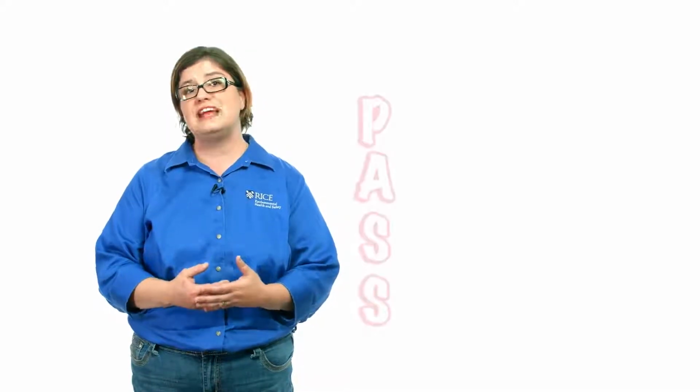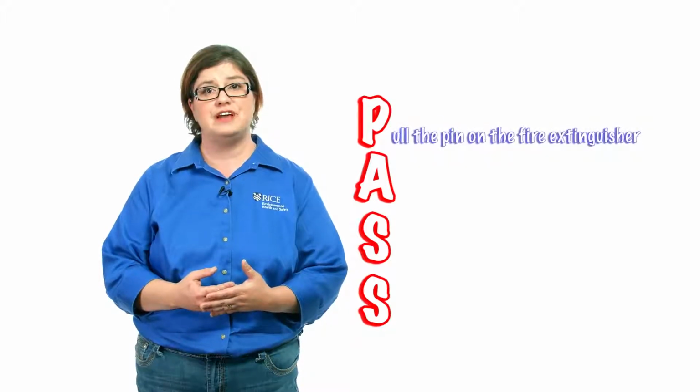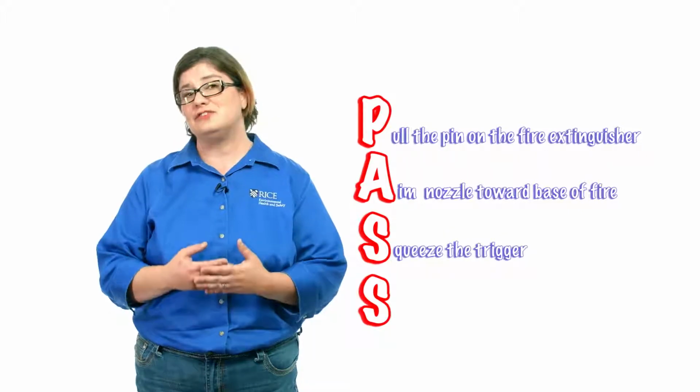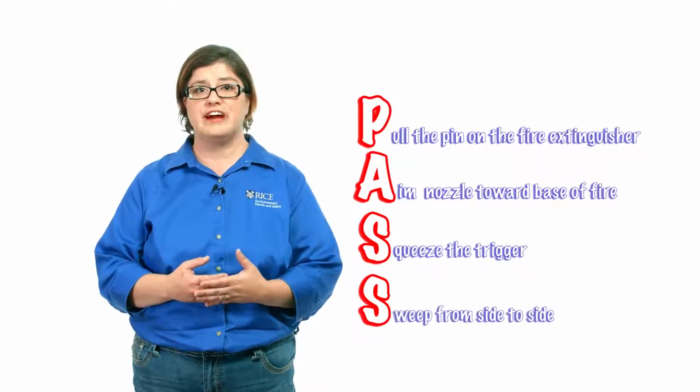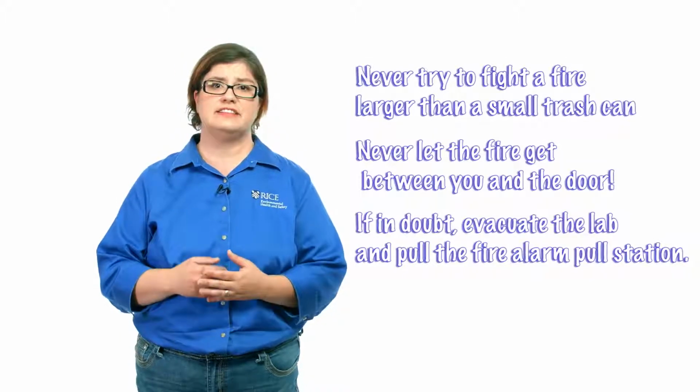If the fire is small enough and you do decide to fight it, use the acronym PASS. That stands for pull the pin on the fire extinguisher, aim the nozzle towards the base of the fire, squeeze the trigger, and sweep the nozzle from side to side until the fire is put out. Remember, never fight a fire larger than a small trash can, and never let the fire get between you and the door.